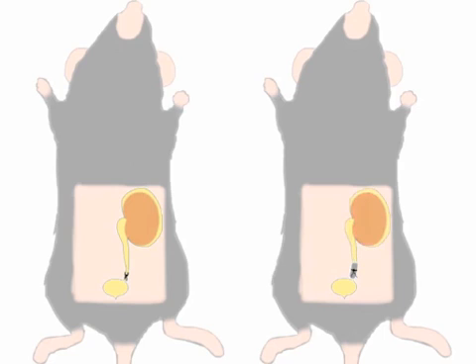The kidney becomes hydronephrotic over time and is then deobstructed at a time point appropriate for the study, seven days in this experiment. The soft wall tubing is removed and the ureter is severed just above the level of ligation. The unobstructed ureter is then anastomosed into the bladder to permit urine flow and the kidney will typically decompress over several days.